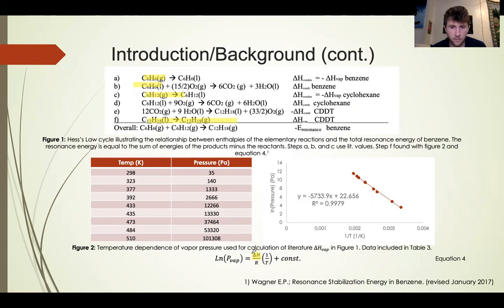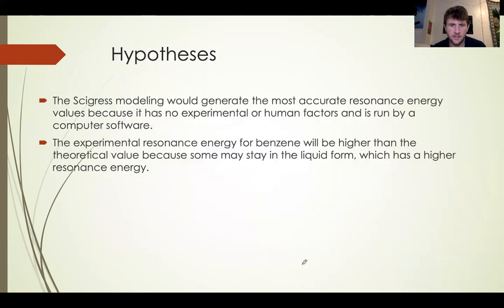Now, this is through the natural log of the pressure and its correlated temperature. So we'll be looking at that again in a second.